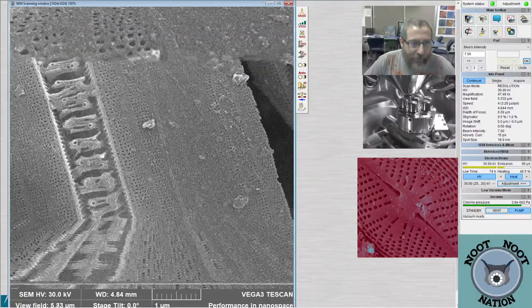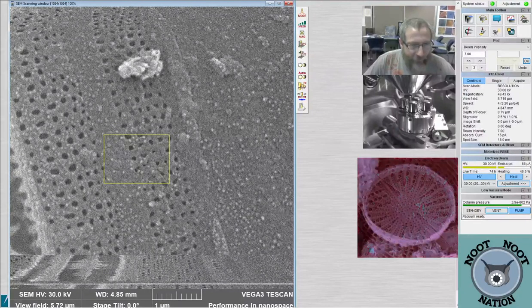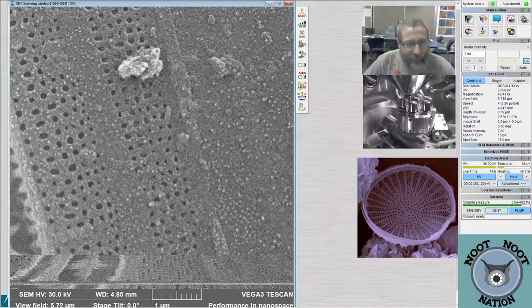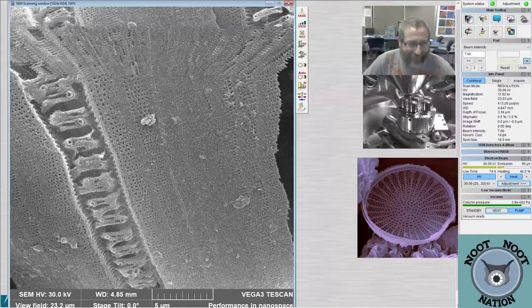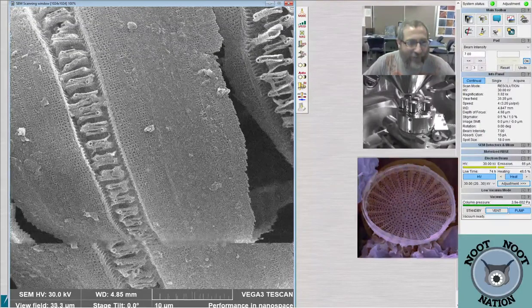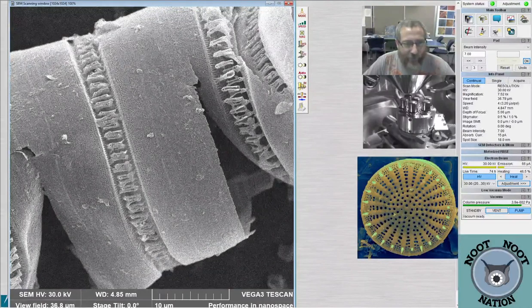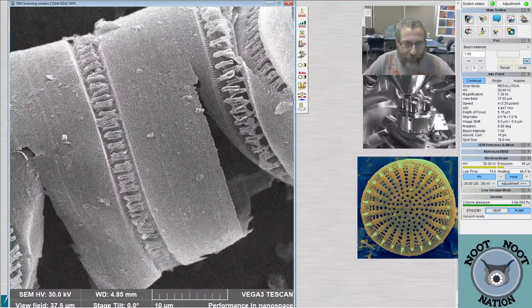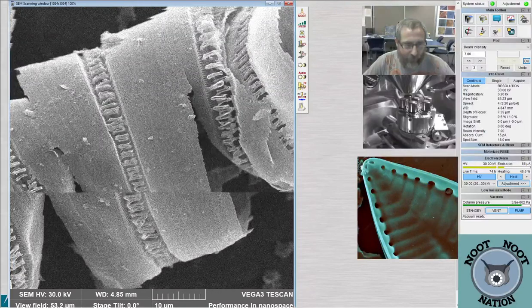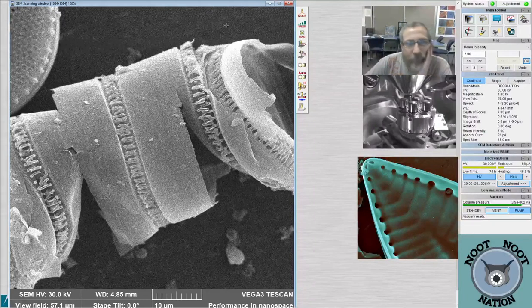I guess we could look at it and keep it. Hang on. Starting right off with a picture. Well, you know. Look at that. Isn't that crazy? Which part's crazy? That I zoomed in? The spines are crazy. Oh, yeah. They have really strange spines. They're kind of like the Skeletonema spines. Huh. Little, like, straight pin sort of looking things. Yeah. Okay.